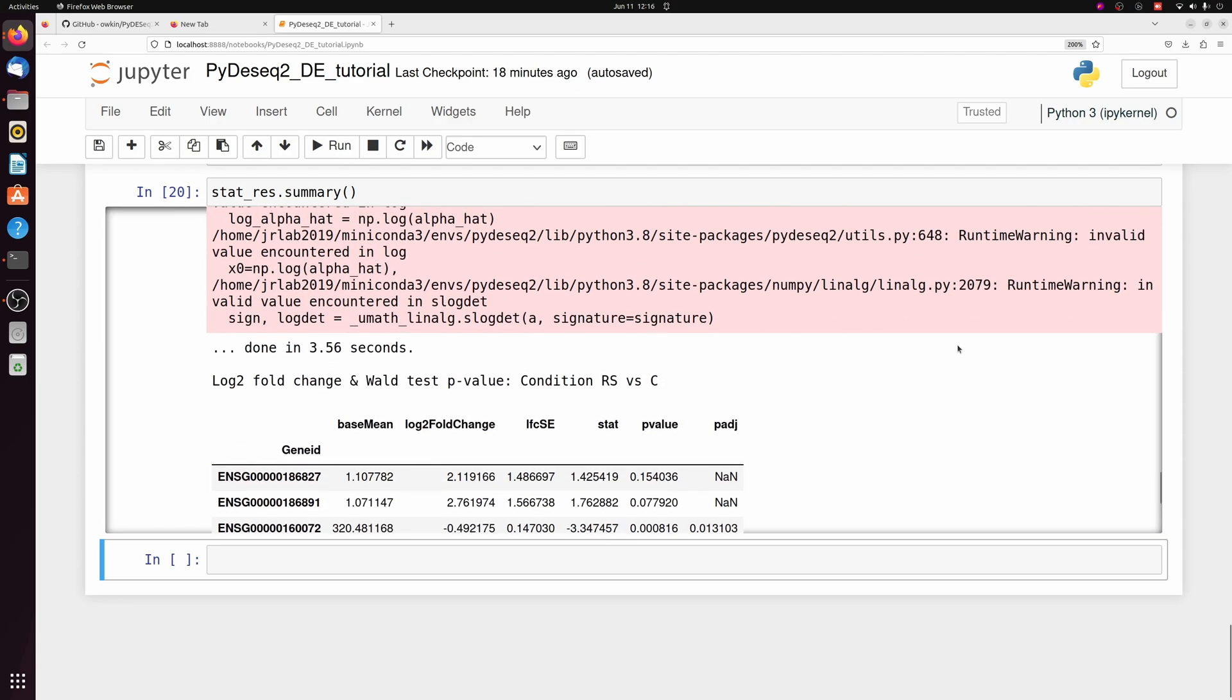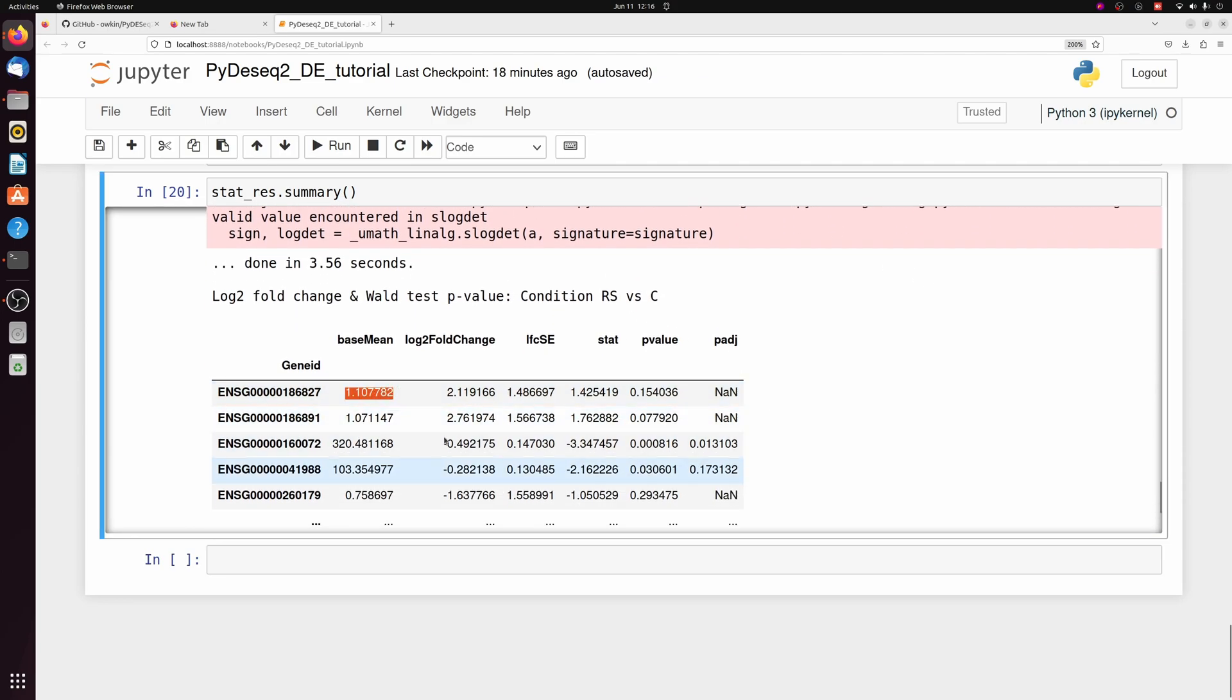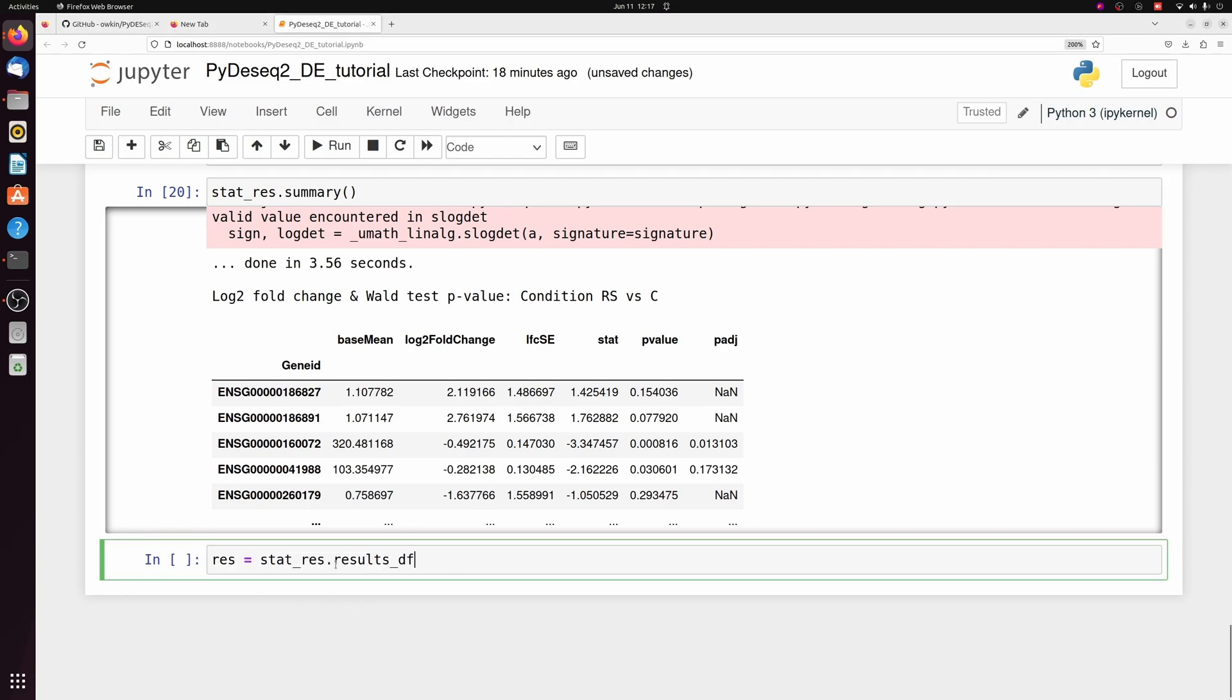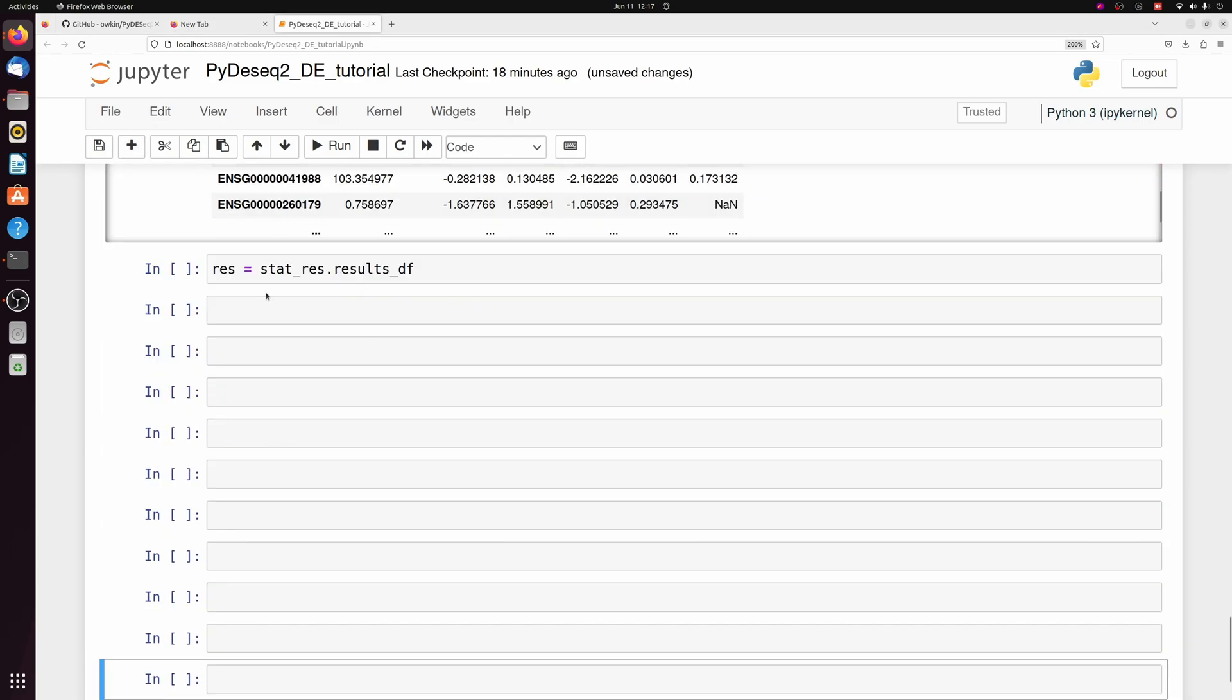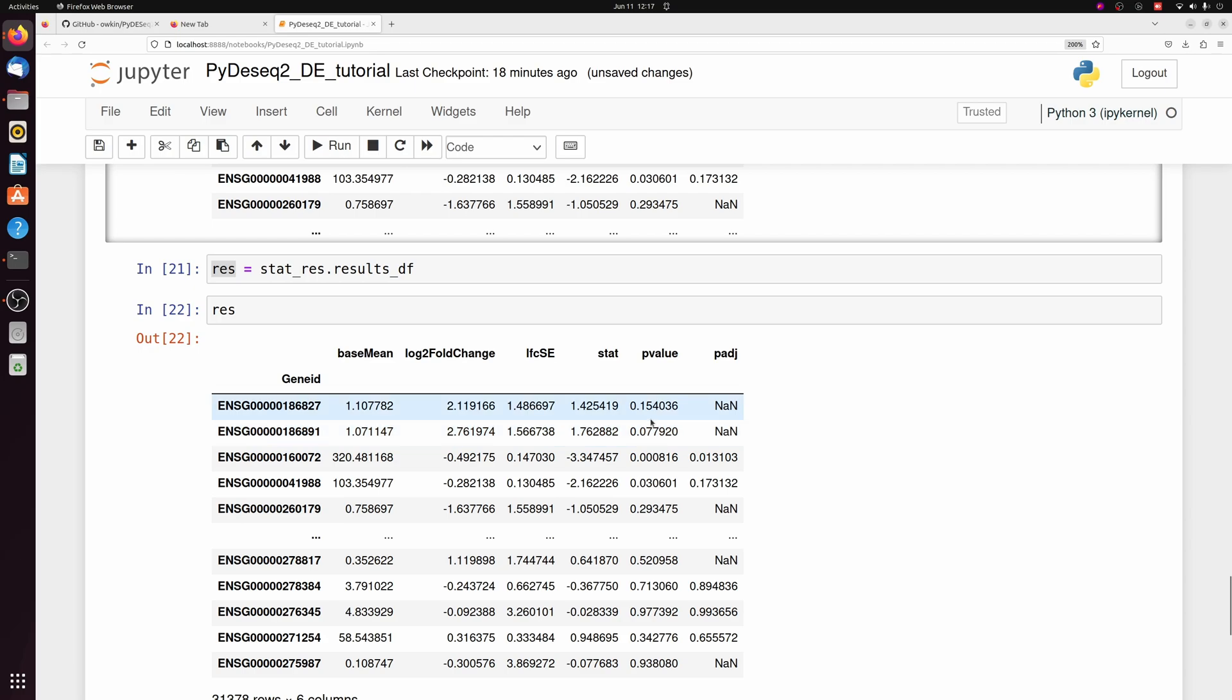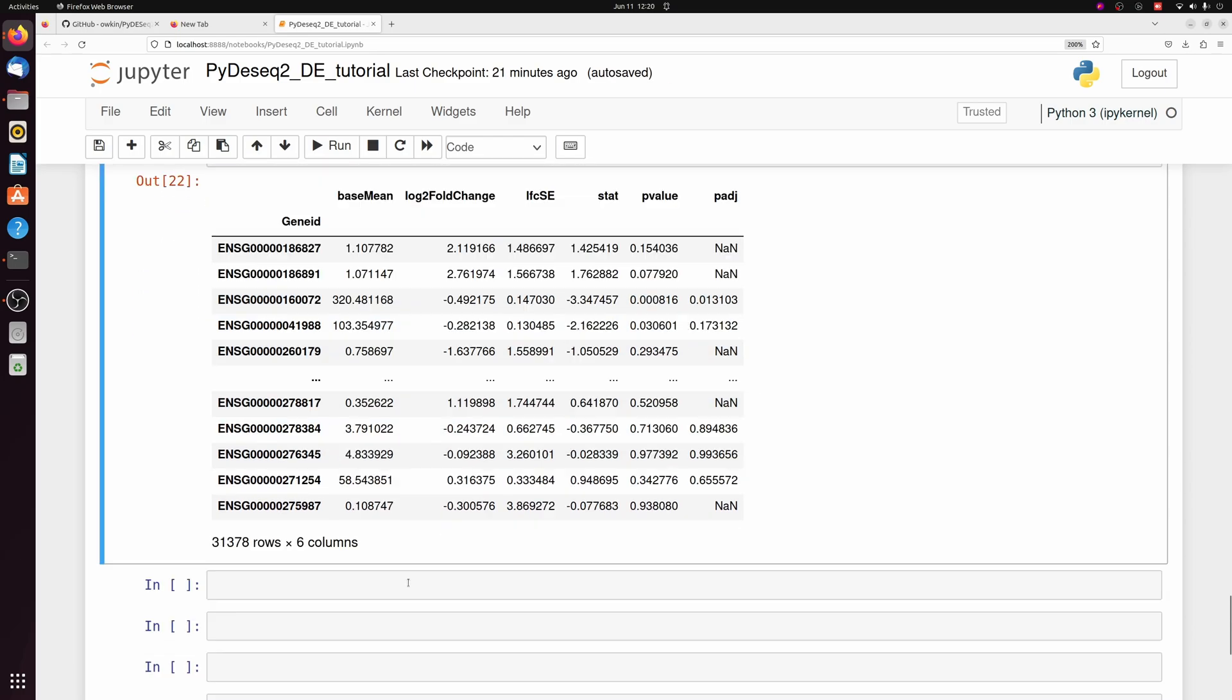So now it actually runs the statistical tests. And you get a lot of output, especially for these ones with very low base mean, which probably had a bunch of zeros. But you can more or less ignore that. But to get the actual data frame now from stat res, we can call the results data frame from stat res. And now if we look at res, we have our differentially expressed data frame.